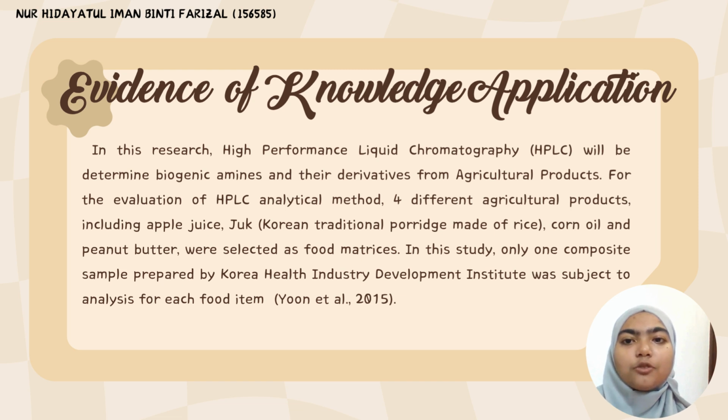So my name is Nur Hidayatul Iman binti Farizal, metric number 156585, and today I would like to present on evidence of knowledge application. From the previous presentation, we know that ingestion of large quantities of biogenic amines in food causes toxicological effects and health disorders. In this research, we are going to use high-performance liquid chromatography, which is HPLC, to determine biogenic amines and their derivatives from agricultural products.